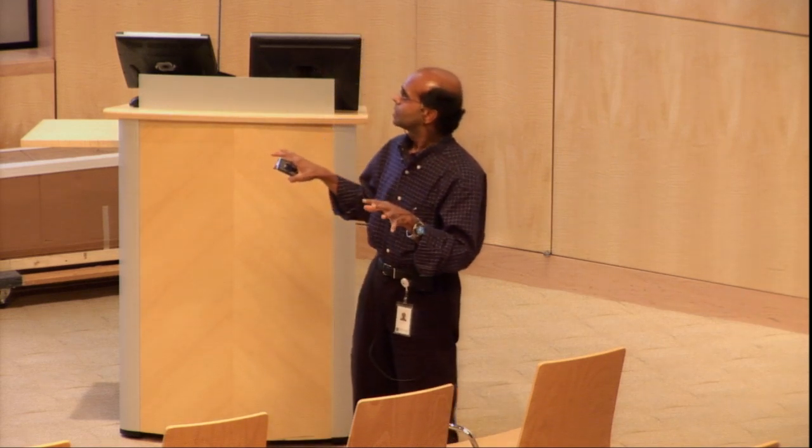So this is the point where I switch from discovery-based to targeted analysis. In discovery-based, like I mentioned in the beginning, you're interested in finding what's different. How do I get there? How do I assign statistical significance? What do I believe? And how do I deal with it?